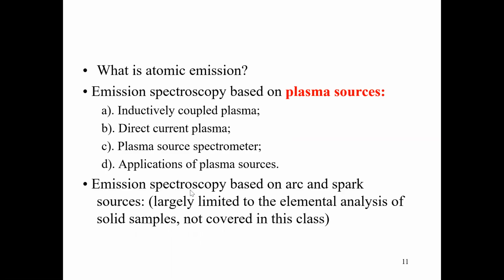There is also emission spectroscopy which is based on the arc and the spark sources. I won't go into those details. This was very common in the 70s and 80s. Some labs still carry those. I will mention them for completeness, in case you happen to be in such a lab, or later on you supervise other people or become a scientist who advocates for science.